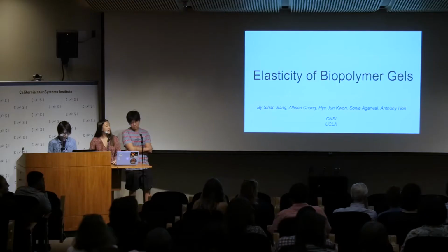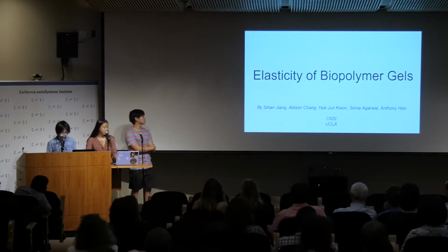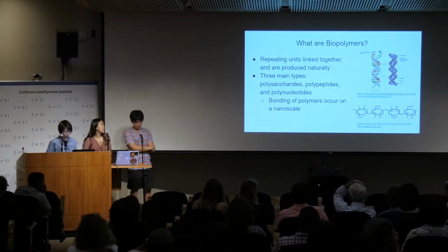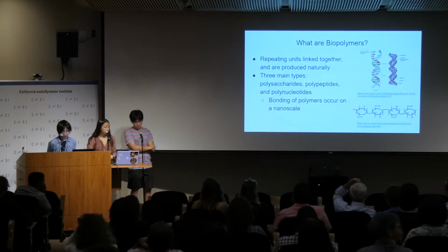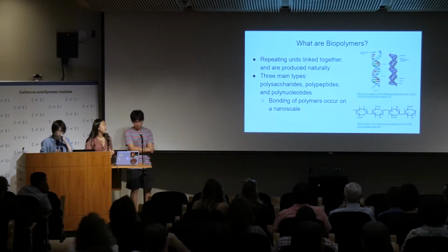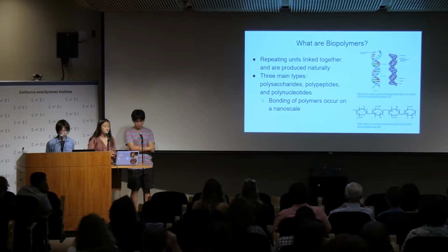I'm Anthony. And our experiment is measuring the elasticity of biopolymer gels. So what exactly is a biopolymer? So biopolymers are large molecules of repeating units linked together, and these are produced naturally by living organisms.